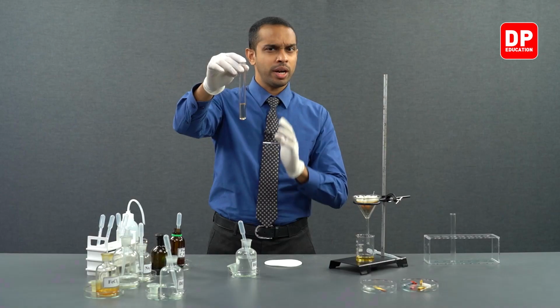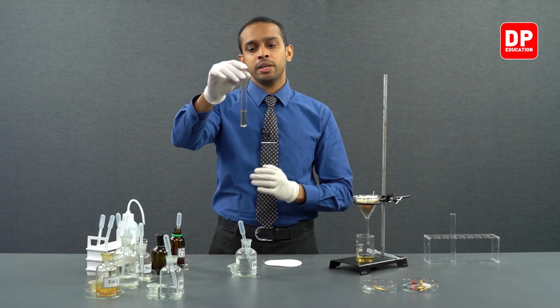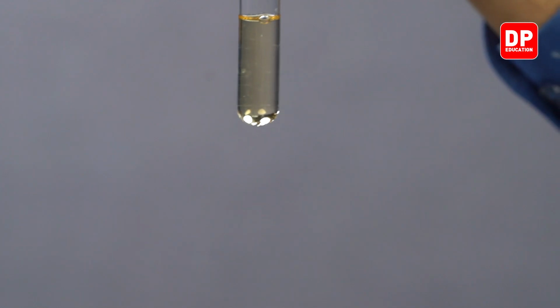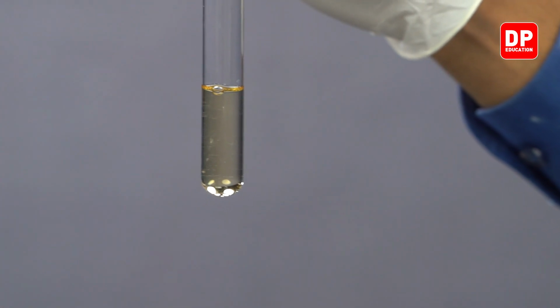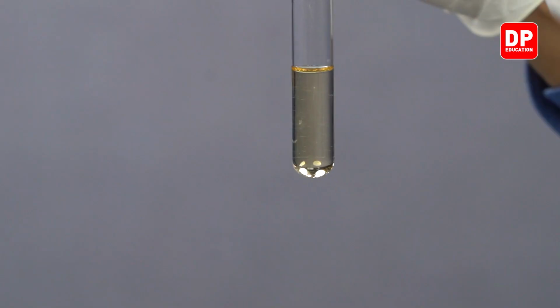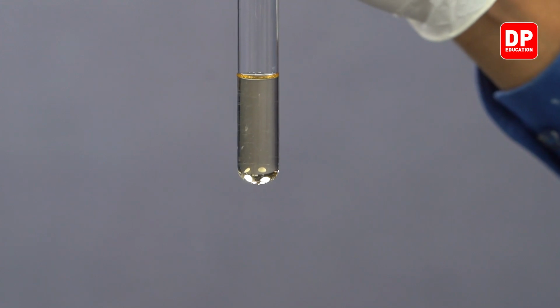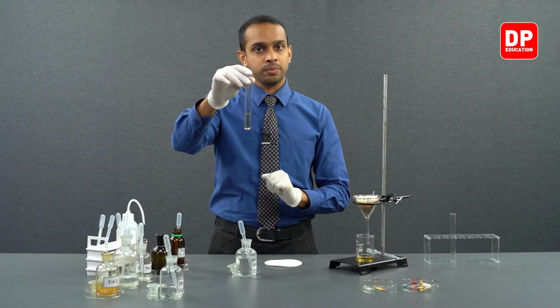But upon addition of HCl, this violet color disappeared and reformed the yellow color that we observed in the initial stages. This is because upon addition of H+, phenoxide anion converts back into phenol.